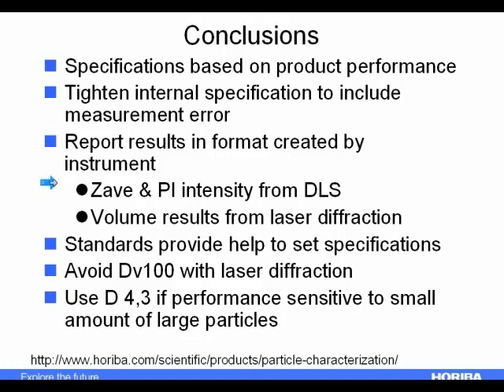The two techniques I focused on were dynamic light scattering, where the Z-average and polydispersity index are probably the approach we're going to use for setting specifications. And with laser diffraction, we're probably using the D10, D50, D90 from the volume distribution.